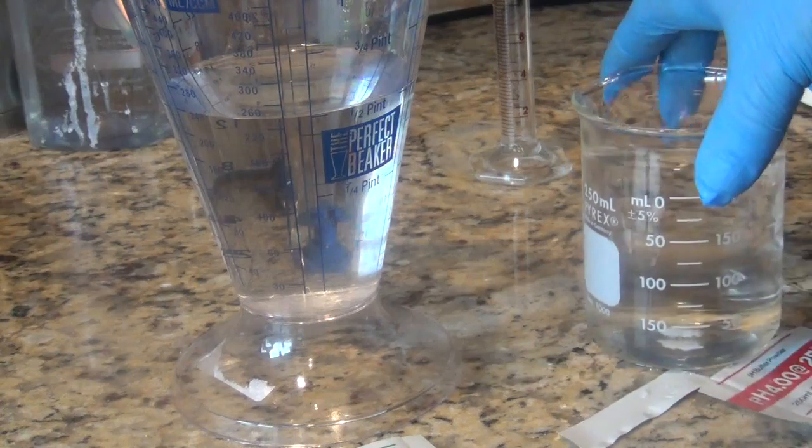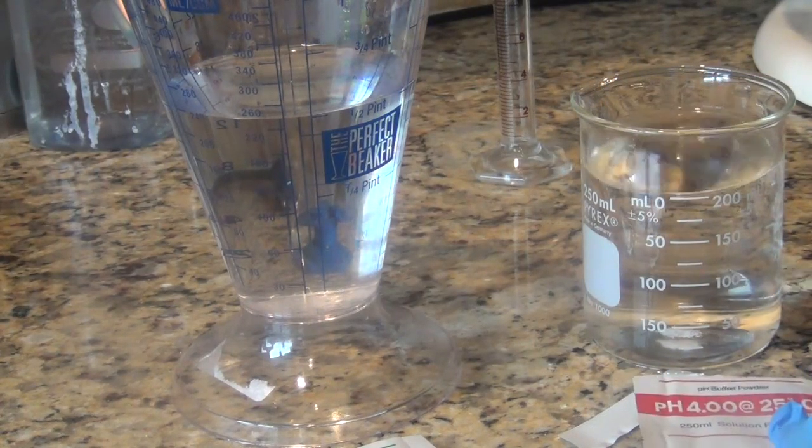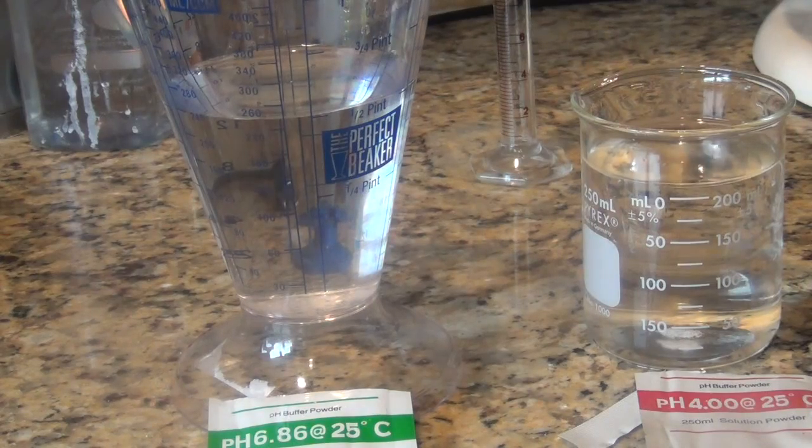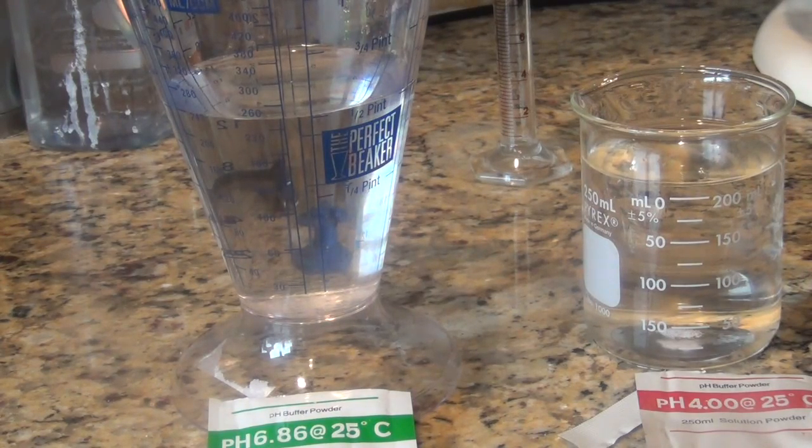And now into this beaker I put the red buffer powder and in this the green buffer powder. So what I'm going to do now is I'm going to turn on my pH meter.